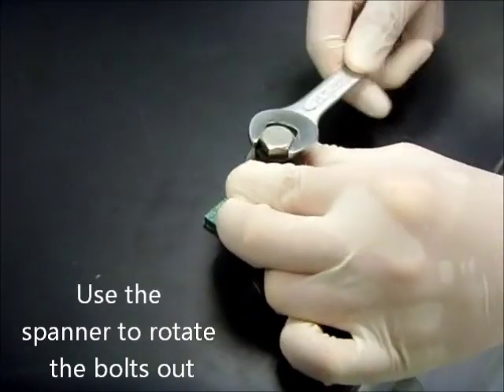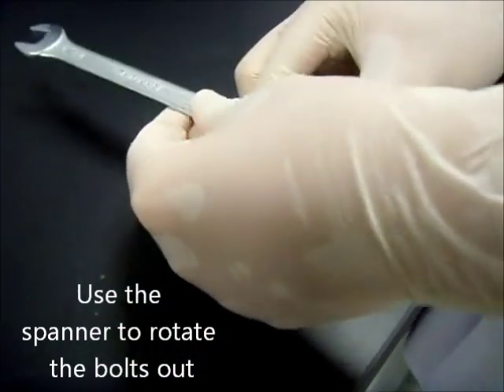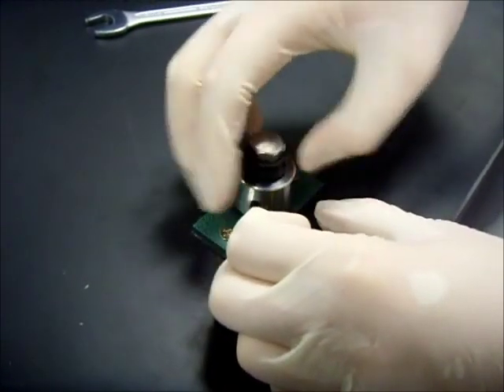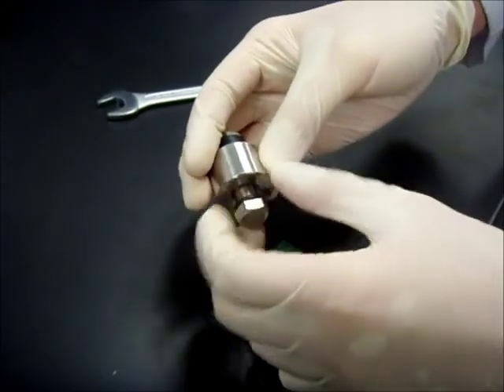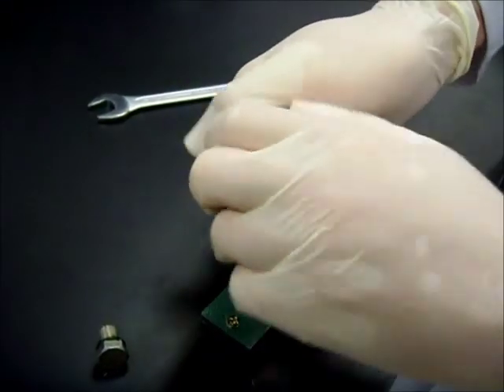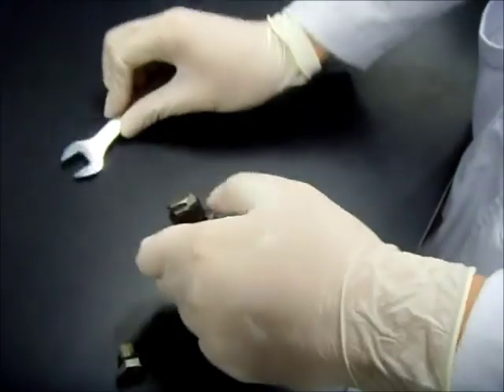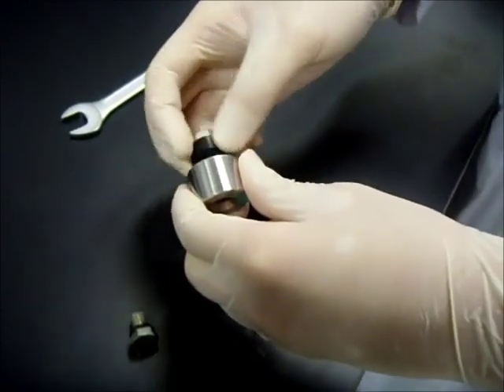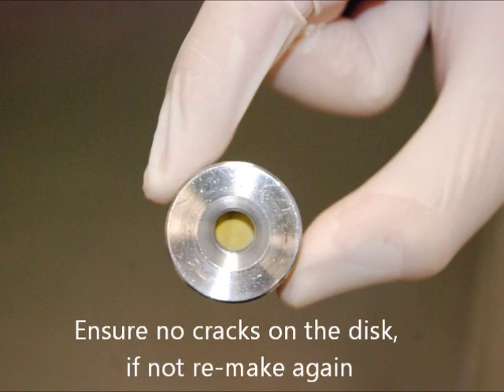When you think it's ready, use the same spanner and rotate the longer bolt anticlockwise to loosen it. You may find that one of the bolts comes out first — it is okay. Well done. You see that now you have a very nice KBr disk.